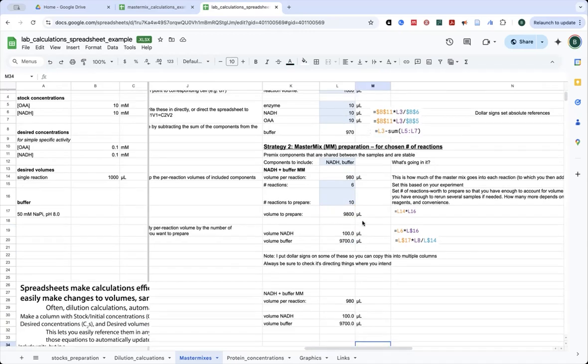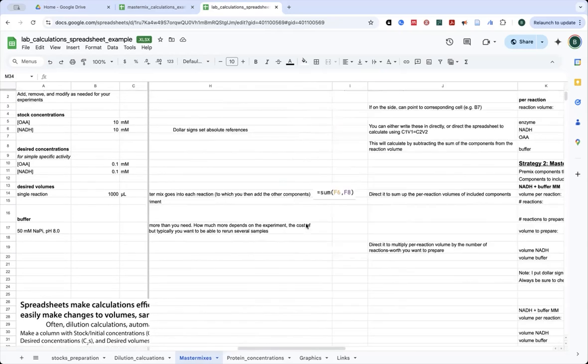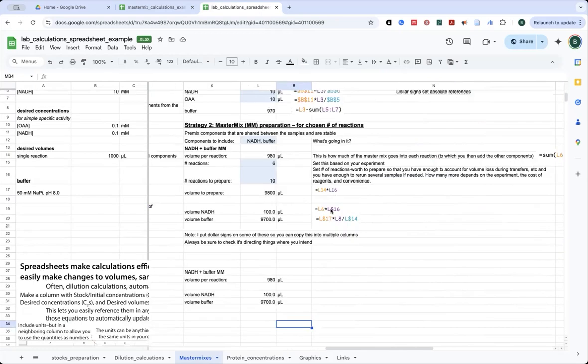So apologies before, I had forgotten to change this to say microliters instead of milliliters. And so remember over here, I had it dividing by 1,000 so that I would end up in milliliters. Here I don't, and so my answer is going to be in microliters. And again, if I want to go the other way now, to go from microliters to milliliters, I divide by 1,000, 1, 2, 3, and then I would see that this would be 9.7 milliliters.